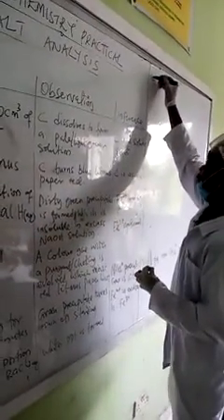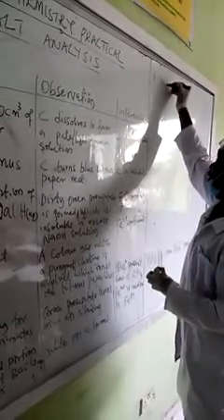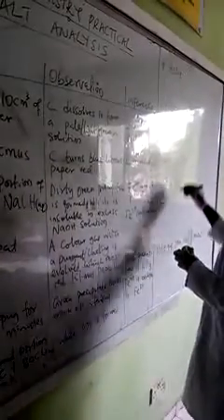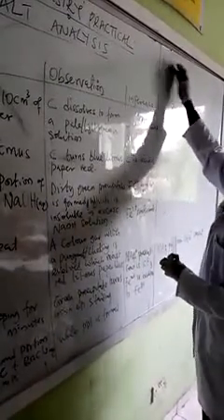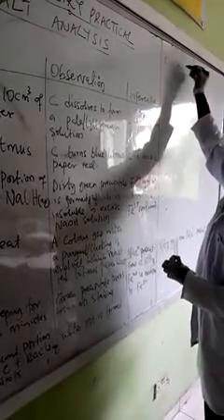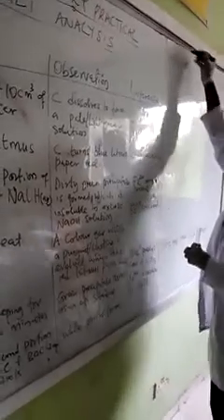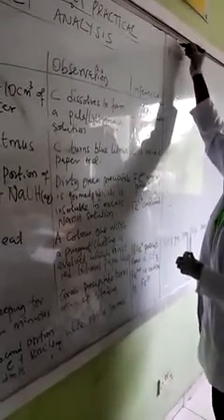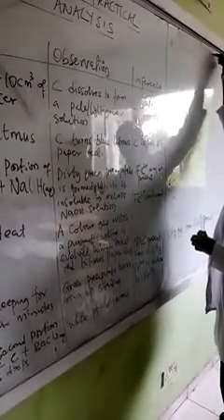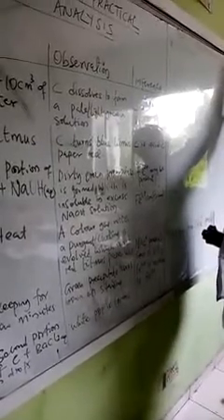Then we now say plus dilute HCl aqueous. So what will that give us? Remember, this is our test. This place is still test. Here is still observation. And this place is what? Inference.